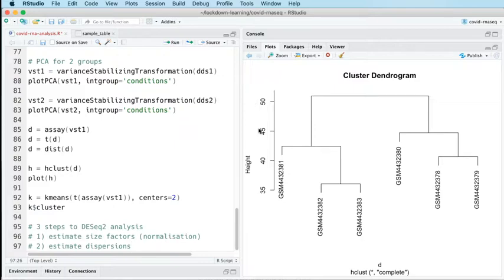What DESeq does is it estimates this variance. So it's an estimate because you can't ever know the true variance without a huge number more measurements than we have here. And it estimates it in quite a clever way. So it doesn't just look at, in our case, we've got data sets where we've got 6 measurements for every gene because we've got 6 observations. And those observations fall into 2 categories, so we can use those categories for estimating a certain amount of biological noise. But that's not very many observations.